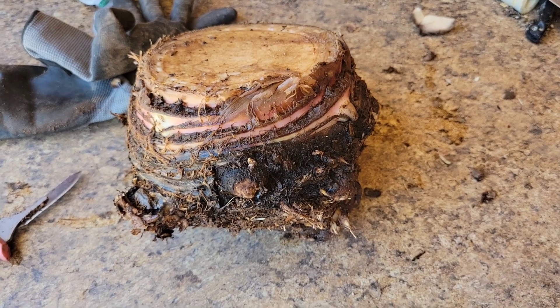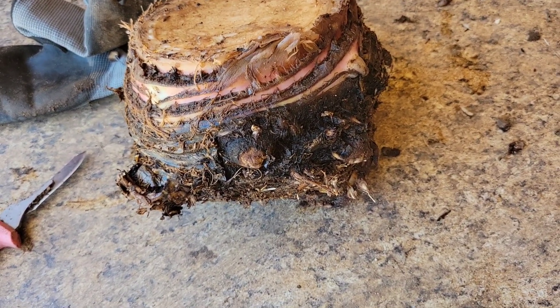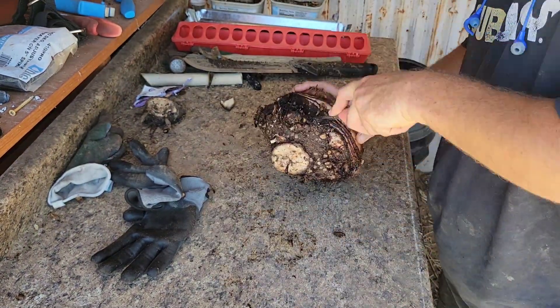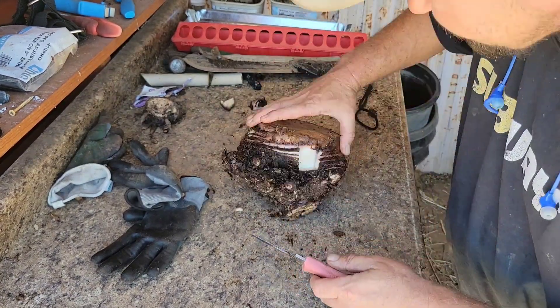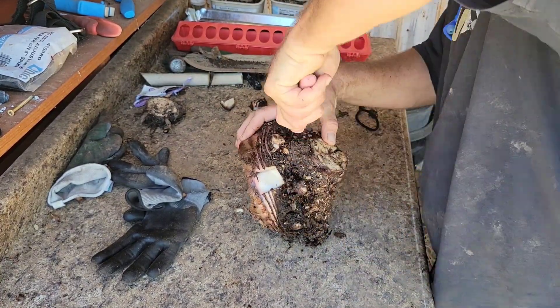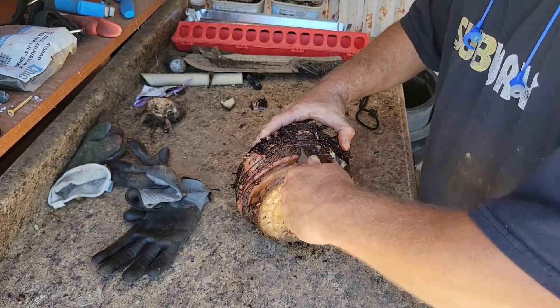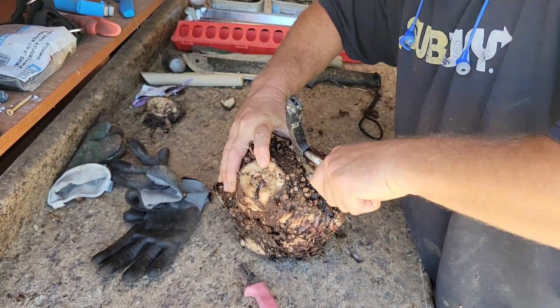I'm going to be cutting them in a rectangle shape, and they're going to be about a quarter to a half inch thick. There she is. There she is. There he is.